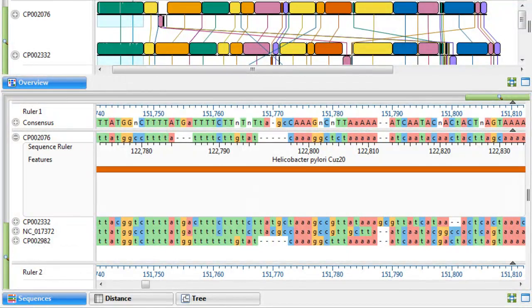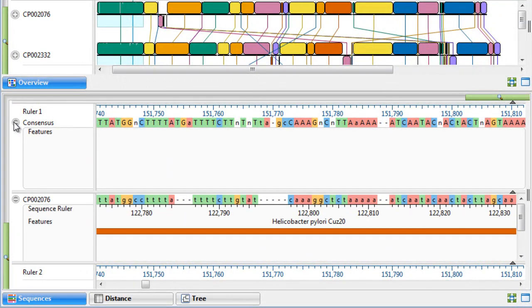Additionally, in the Sequences view, you have the ability to copy features to the consensus sequence.